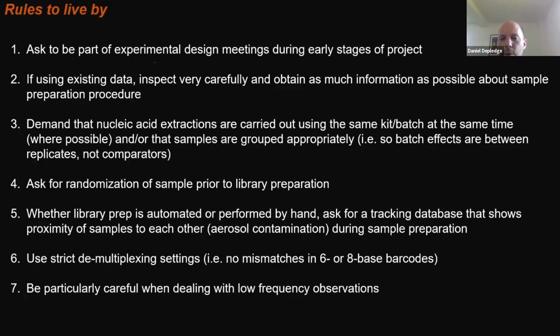Whether using short or long read data, you will often find that, if you see a mutation or if you see an RNA expressed at low levels, a low frequency mutation, a lot of the time this can come from errors in the sequencing or from the assembly or alignment of data. So it's always worth spending a bit of extra time looking at this more closely, and if possible, trying to eyeball the data yourself to convince yourself and others that what you're seeing is really real.